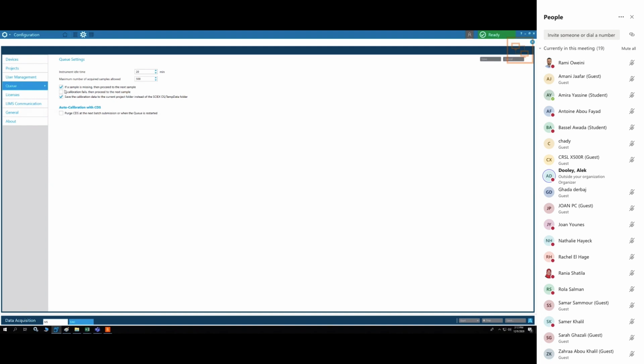But the first two, you can decide amongst yourselves which option is the best one. And you can control that amount of time in this box here. And don't forget, it's not just changing it, you then have to press save here. The save is so far away, so just remember to come and click save here.